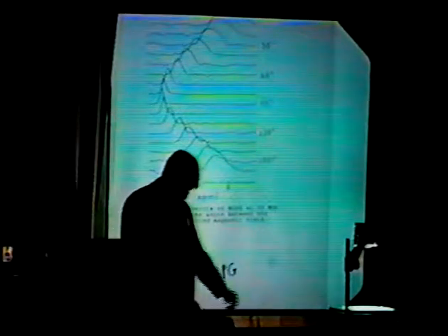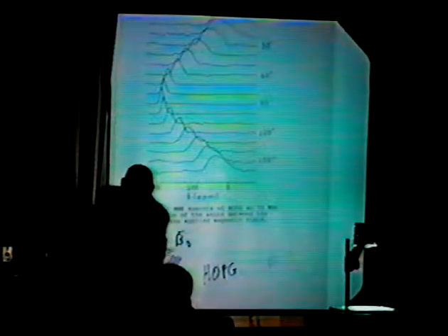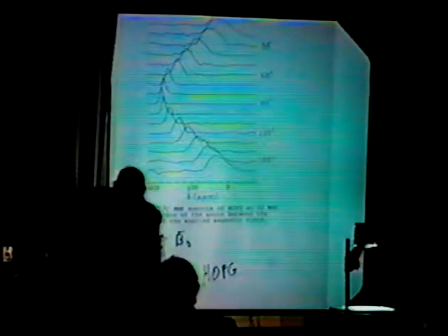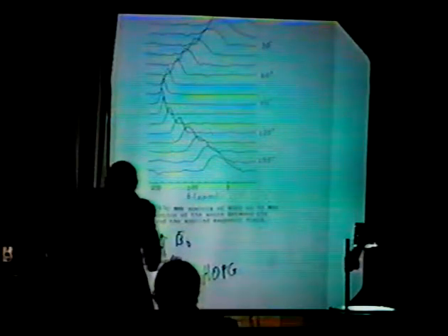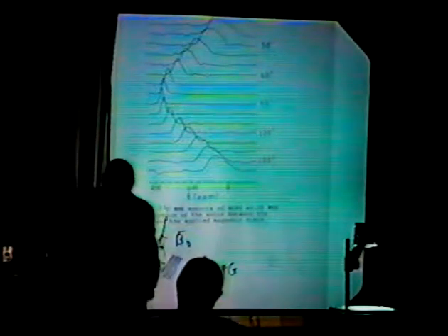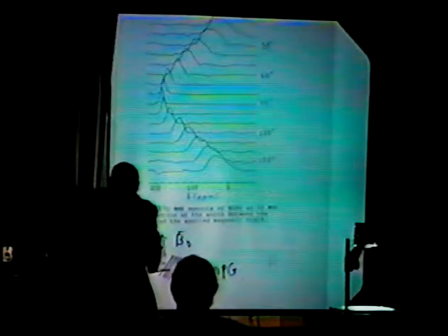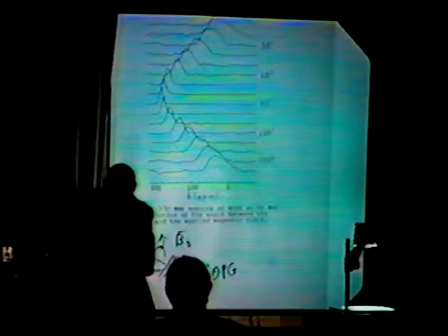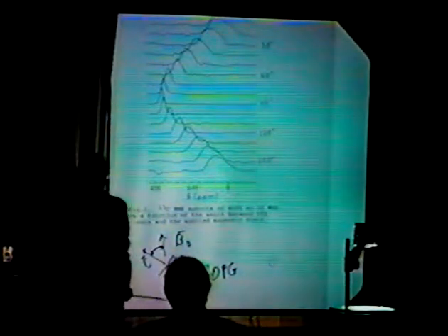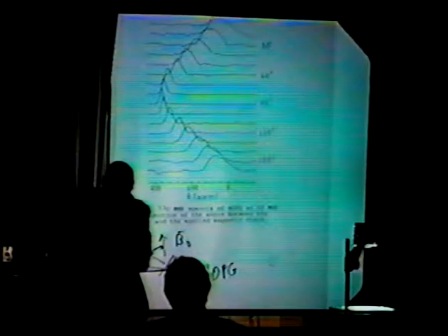In other words, the graphite consists of planes. These planes are highly parallel to one another over the large crystallite that we use. But it's really a polycrystalline mass with all these axes parallel, all these planes parallel. But there is disorder in the plane as you go from one crystallite to another.